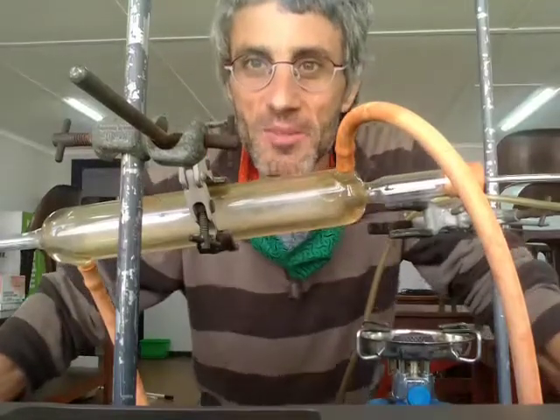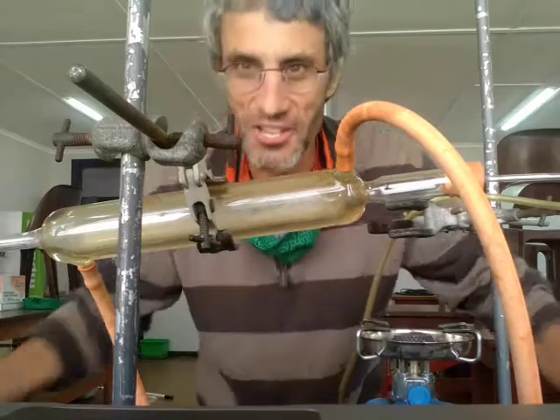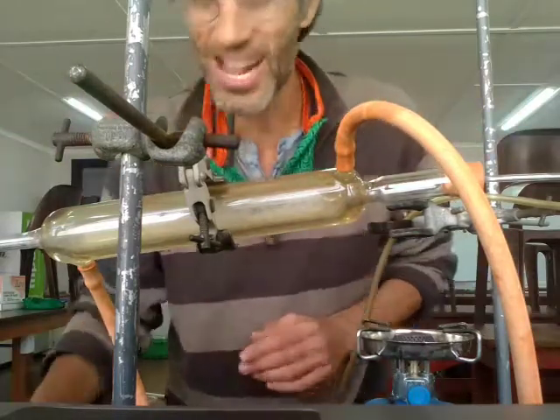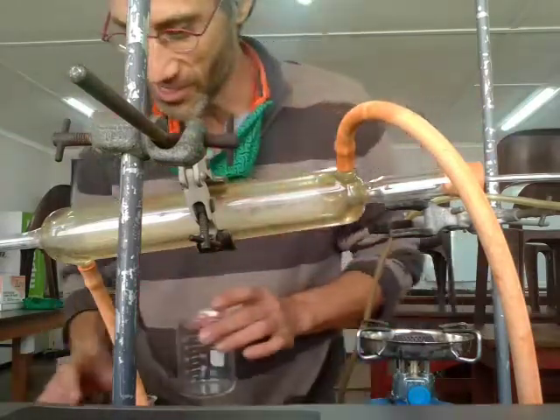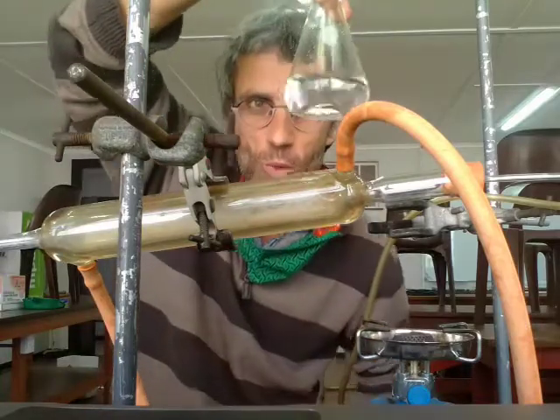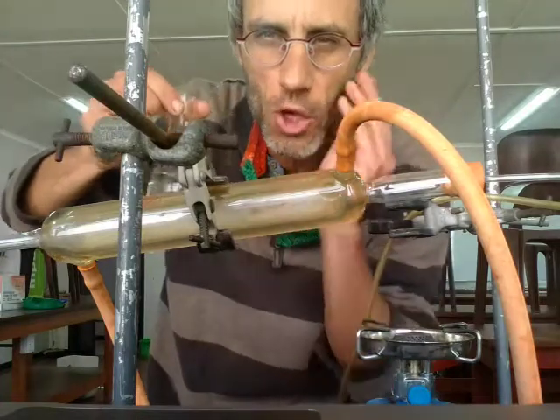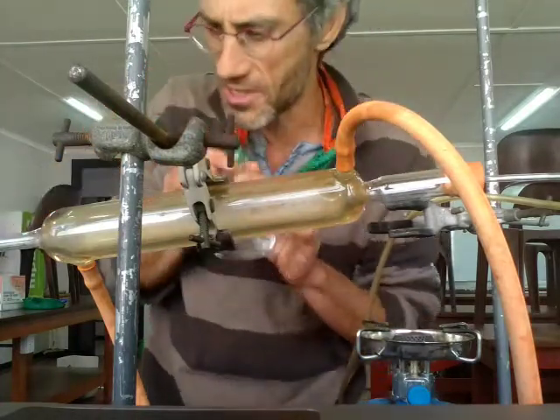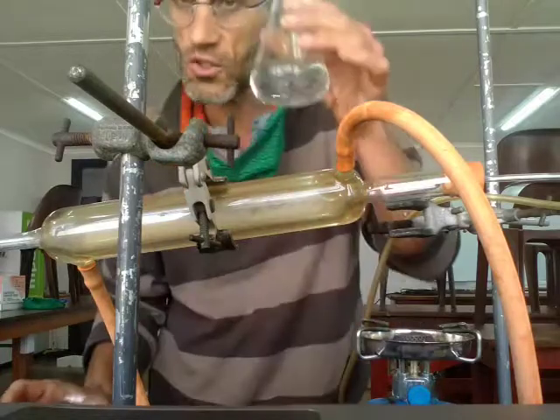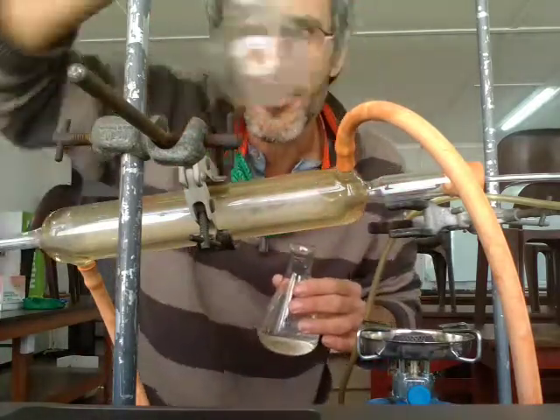Chaps, our next method is called distillation. What is distillation? You can see quite a complicated kit here. I will go through and explain it all. So I've got water. You've got water in this. This is called a conical flask. Remember, there's a lot of technical terms we need to remember. This is a beaker. This is a conical flask, and this is a round bottom flask.